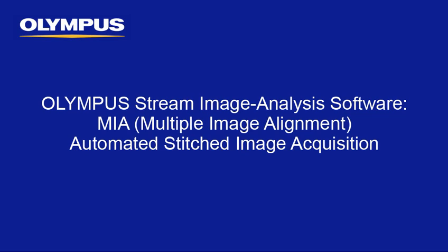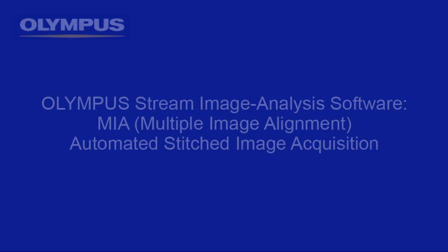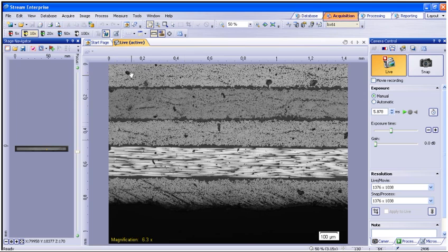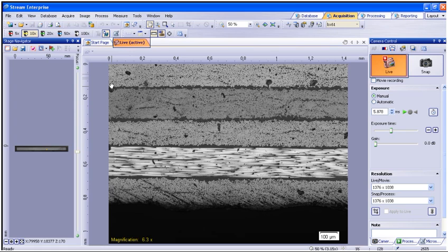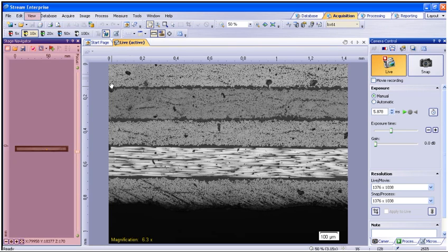Automated MIA is available within Stream Motion or Enterprise. To begin, you will need to be within the Acquisition tab. You should have a live image on the main screen. The Stage Navigator tool window should also be opened through the View menu drop-down to generate the MIA.